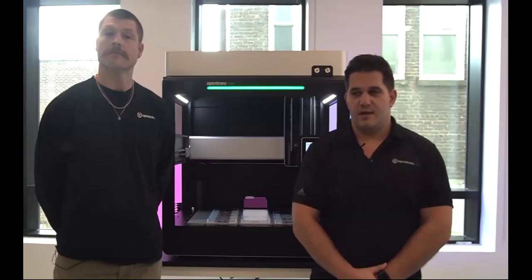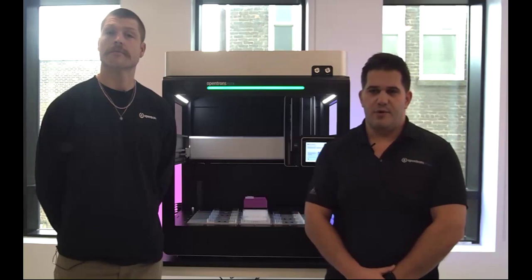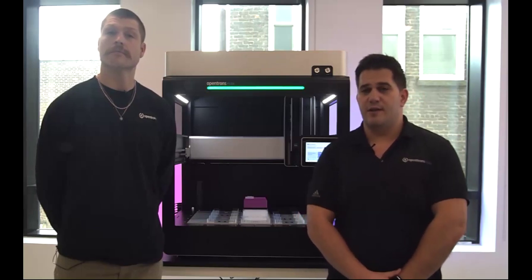But as I see it at the moment, we actually only have the one question, which is, can the gripper and 96 multi-pipette be installed together so that we can do 96 well liquid transferring and labware movement in the same workflow? Yes. So the gripper can be attached to the robot no matter what pipette configuration there is.